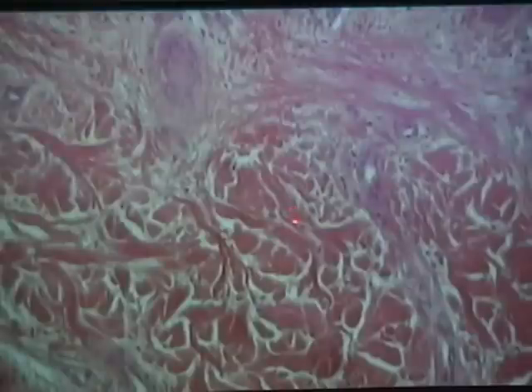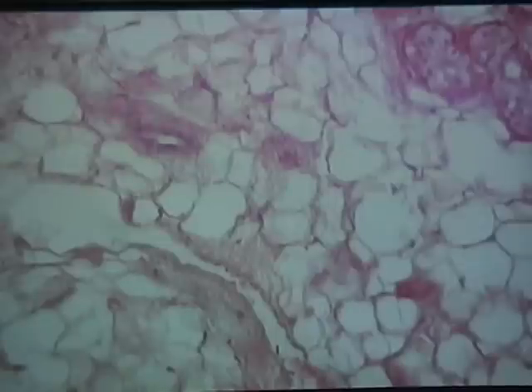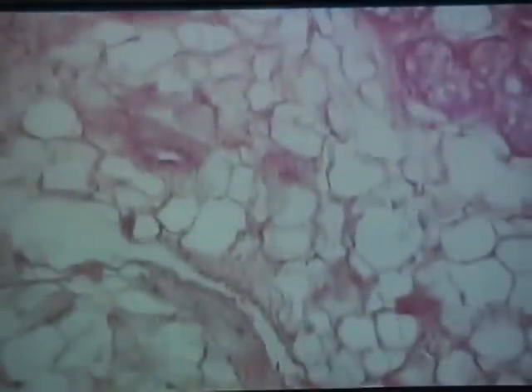And the dermis of the skin is composed of dense, irregular connective tissue. As we go deeper, we get into another type of connective tissue. This is adipose connective tissue. This is fat. And so you can see all three of those types of tissue on this one slide. As you're studying the slides in the lab, when you find yourself recognizing a tissue that is not even referenced on the slide that you're looking at, that'll be a good indication for you that you're really starting to recognize these tissues.